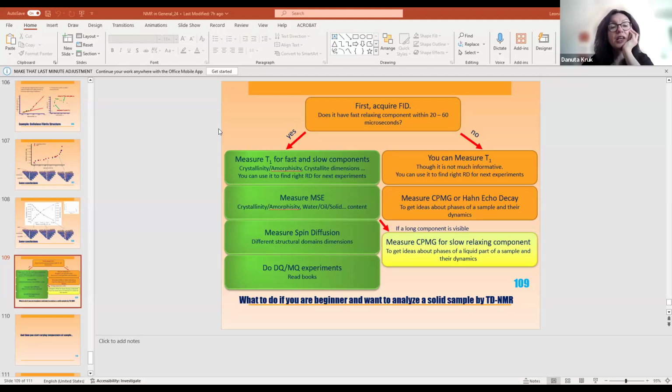Because actually, if you take fluorine, for instance, there's no exchange between proton and fluorine or anything like that. Yeah, but we are talking about exchange between equal nuclei, not between proton and fluorine. But you know, there's no heteronuclear exchange.